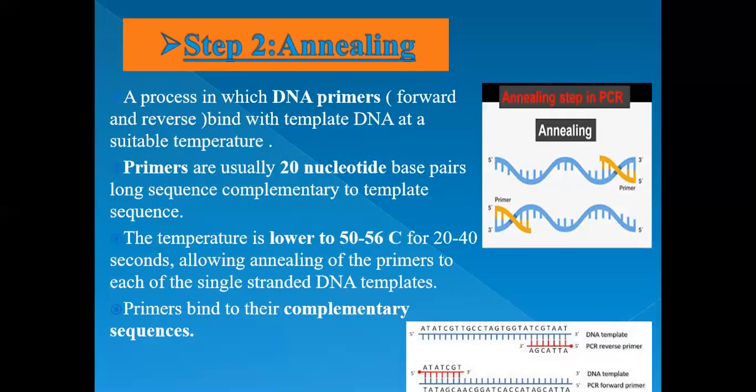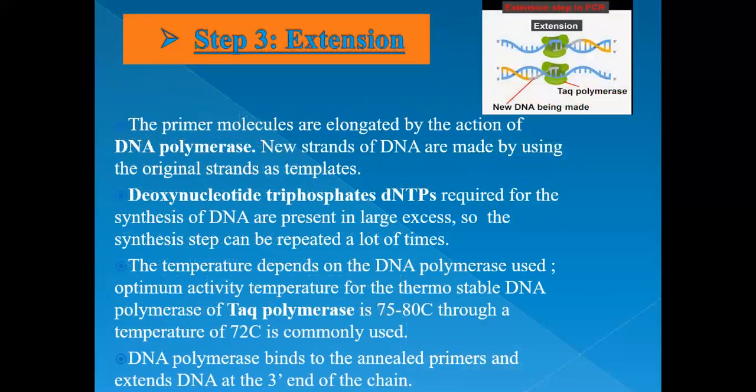Primers are usually 20 nucleotide base pair long sequences complementary to the template sequence. Primers bind to their complementary sequences, and primers in the PCR tube can bind to the target sequence on the single stranded DNA. Next step is extension.